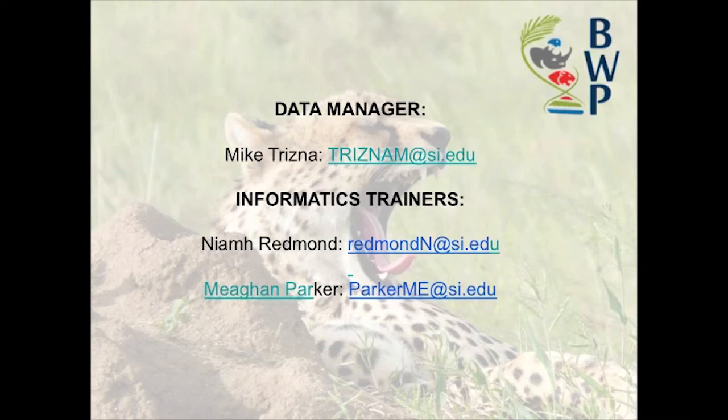This brings us to the end of our FIMS spreadsheet instructional video. We hope that this tutorial has been clear and informative. If you have any further questions with regard to populating your spreadsheet, please don't hesitate to contact the BWP Informatics trainers. Their contact information is listed here.